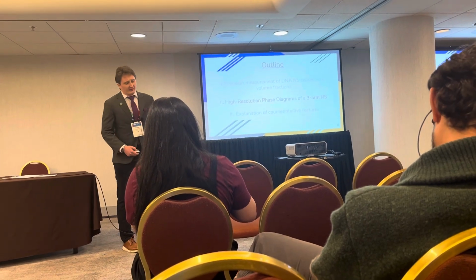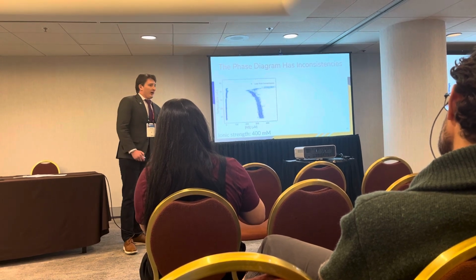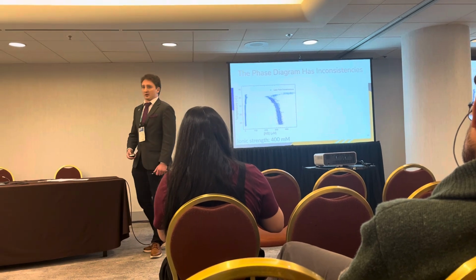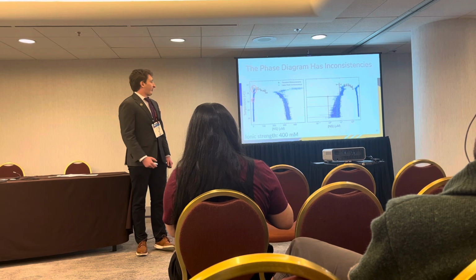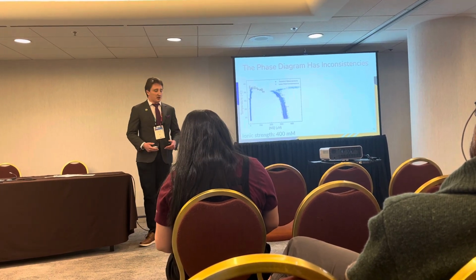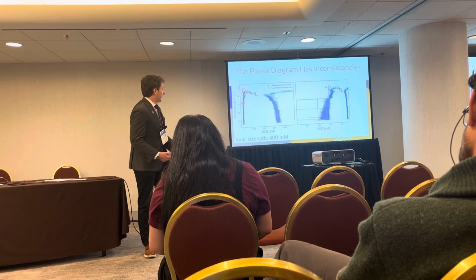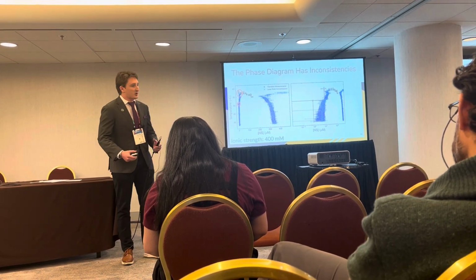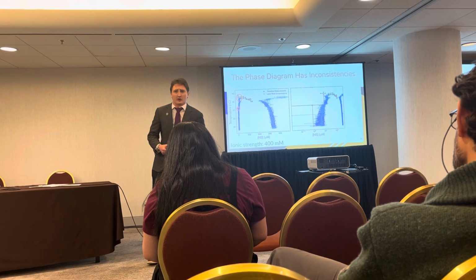So, let's show you some of these highly resolved in temperature phase diagrams. And here it is. Each of these two points at each temperature come from an individual lever rule calculation, measured under what I call an adiabatic ramp protocol. As such, let's take a look at some inconsistencies. We measured the actual transition temperatures at which concentrations went from a heterogeneous system to being just a homogeneous suspension. And we're able to see that this lever rule model seems to be over-predicting the dilute phase concentration, as the small concentrations are melting at temperatures that are higher than the curve would predict.